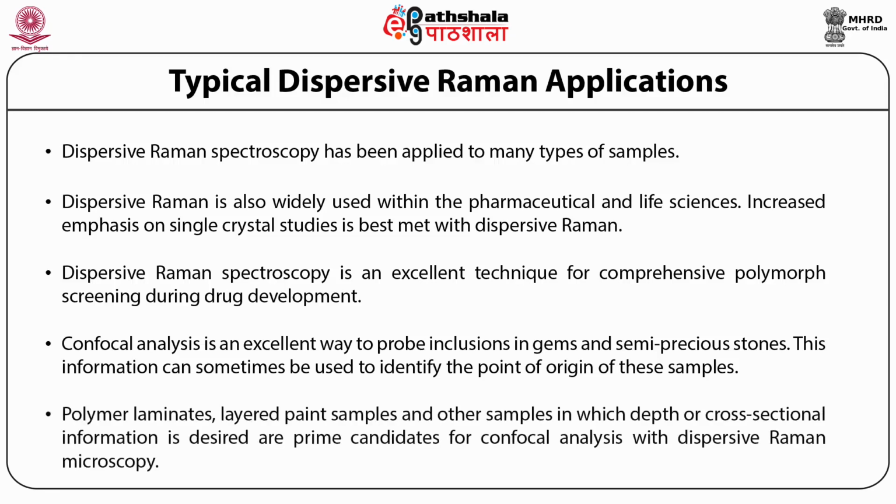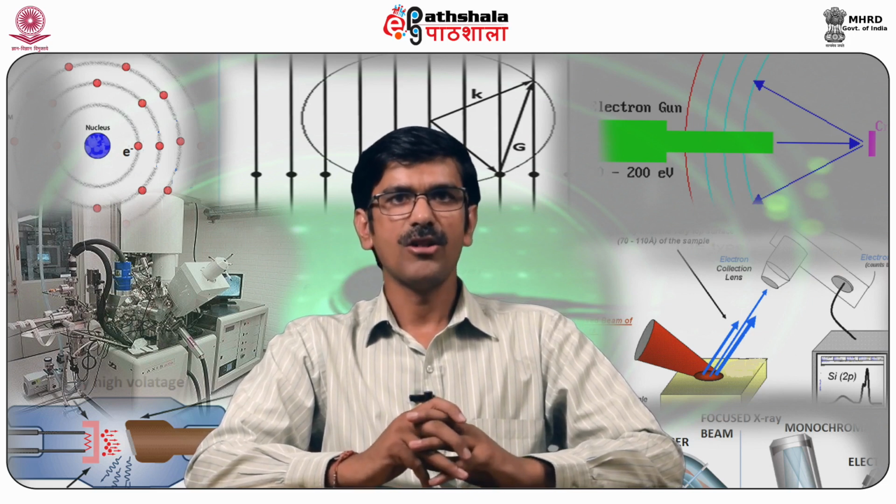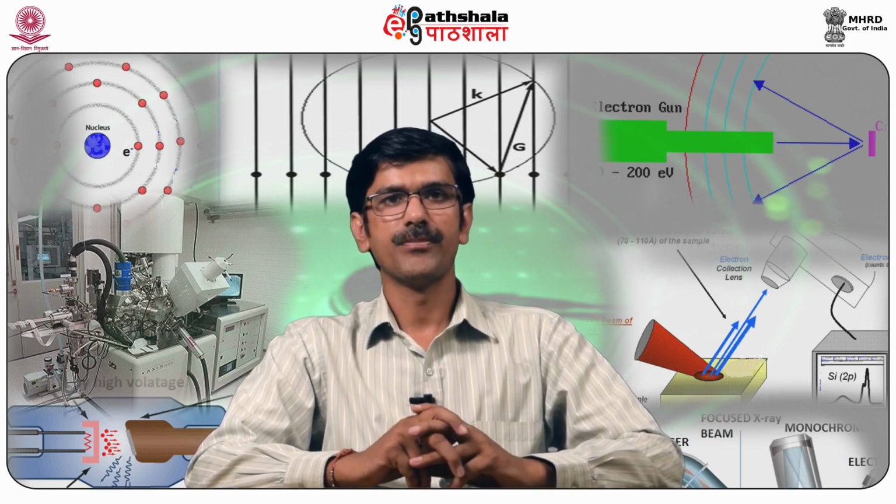Polymer laminates, layered paint samples, and other samples in which depth or cross-sectional information is desired are prime candidates for confocal analysis with Dispersive Raman microscopy. So students, let's summarize all the content that we have studied today.